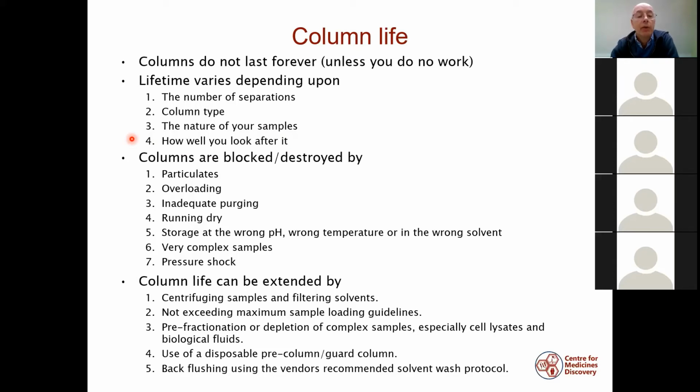So what shortens column life? Well, columns can be blocked, or they can fail to separate because they get blocked by particulates. They can be overloaded. You should try to avoid this. If you fail to purge the column properly, if the column runs dry, this can be bad for it.